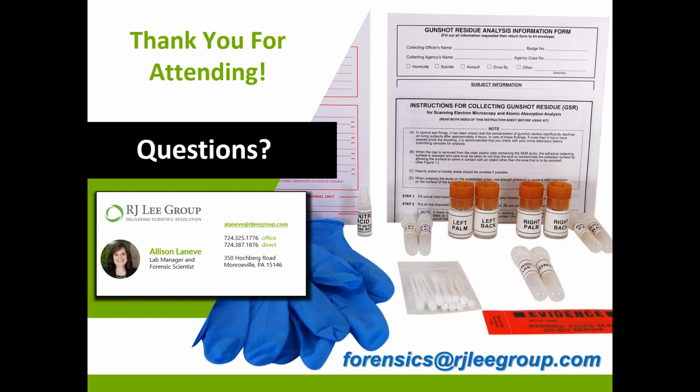I, of course, want to say primer gunshot residue, but if it is a steering wheel, for example, I would probably collect for touch DNA first, just because that evidence is going to be more important if you can get a profile than potential primer residue that could be on there. So I would collect for touch DNA first and then primer gunshot residue. That touch DNA is more sensitive, I should say.